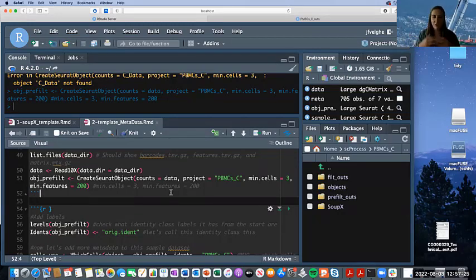Some people, especially bioinformaticians and statisticians, will just set, oh, we're going to get rid of the lowest 5% of these, highest 5% of these. We're just going to cut off the ends of the spectrum statistically, but then you could be missing things that you want to pick up, that you're anticipating, you're looking for. So if that's the case and you're missing things from your data, go back and drop this down a little bit.